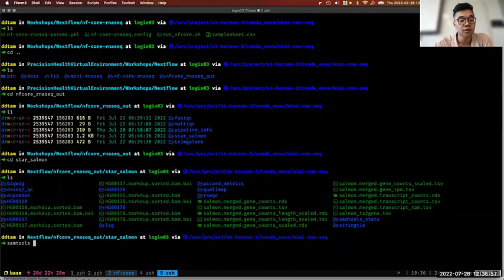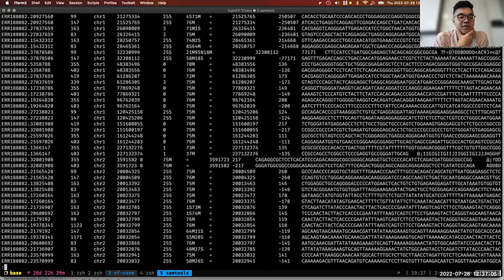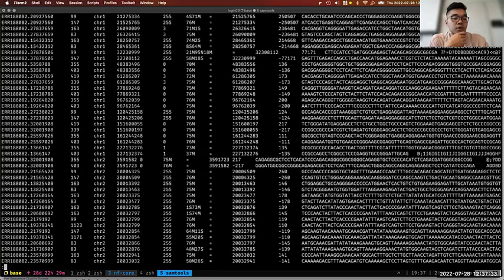If you want to look at the BAM, for those of you who have never seen a BAM before, this is the name of your read, and this is where it aligned to, and then a bunch of, I think, CIGAR strings and things about the length and the map quality. And then these are the reads, the reads that came out of the trimmed and processed FASTQs. And the duplicate flags, they're all in there.